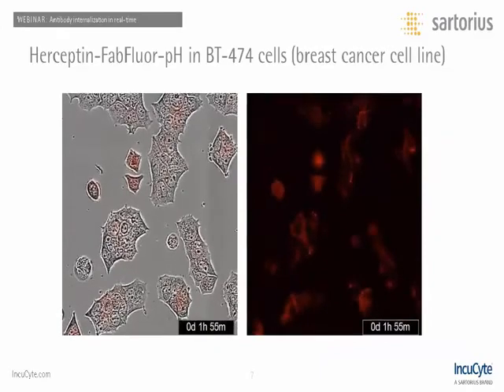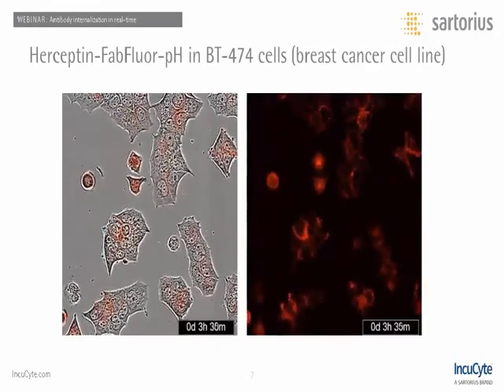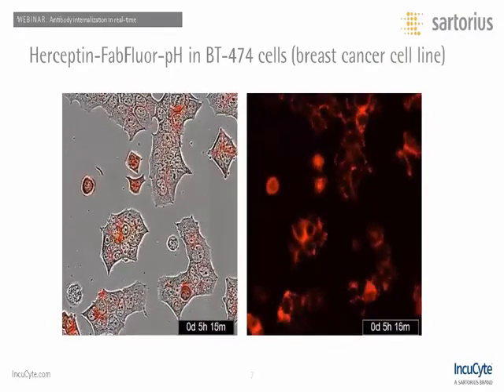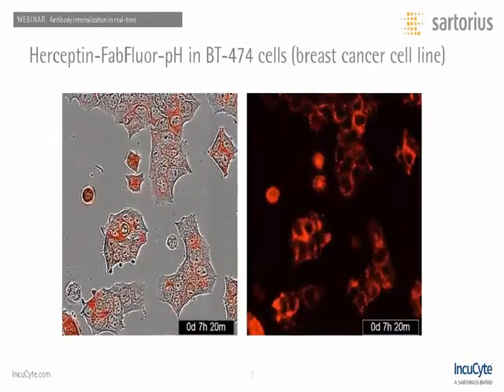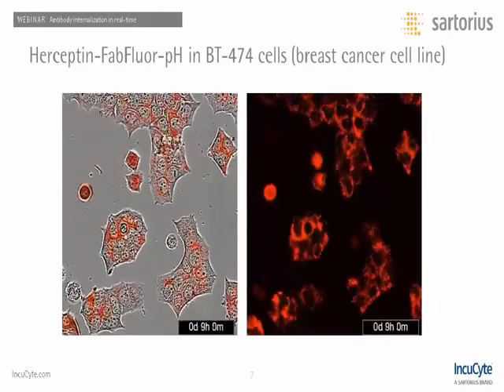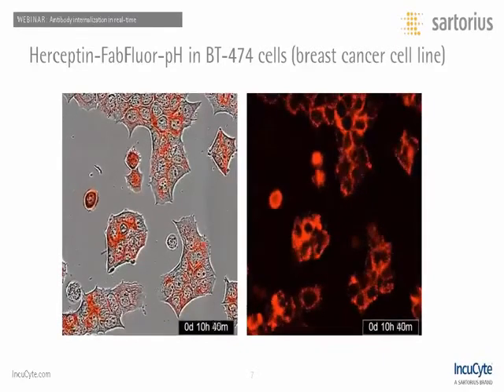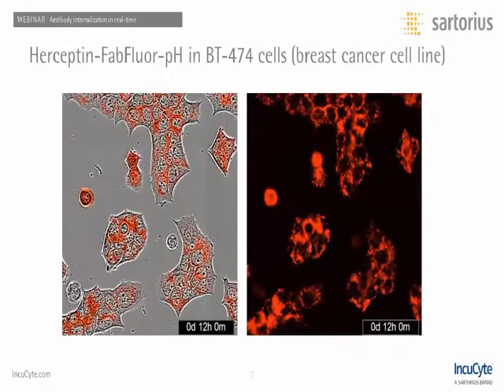Looking at what this appears like on the Incucyte, here we can see a movie in BT474 cells, which are a HER2-positive breast cancer cell line, treated with Herceptin conjugated to the FabFluor reagent. Even after six hours, there is a very bright red signal within our cells. Looking at the red-only image, this signal is very cytoplasmic and punctate in nature, which is expected if it is entering the lysosomal pathway.